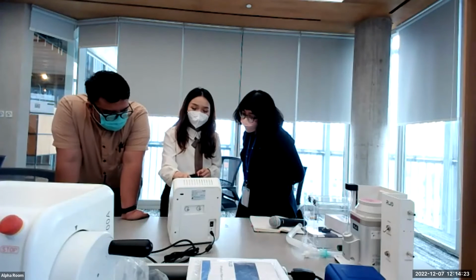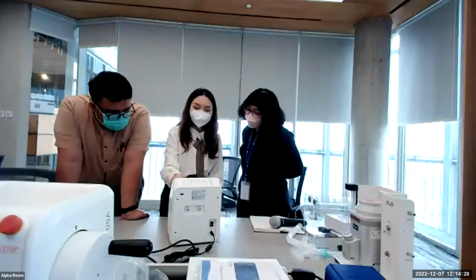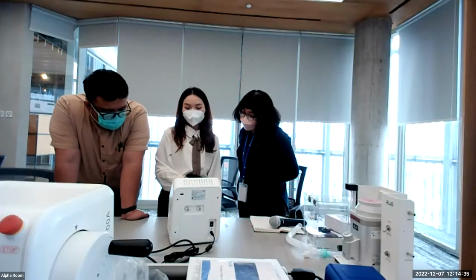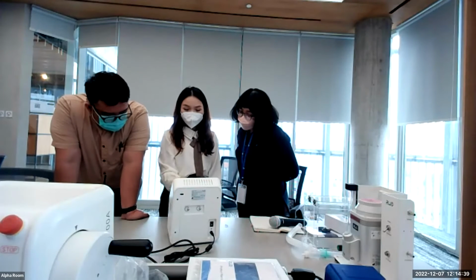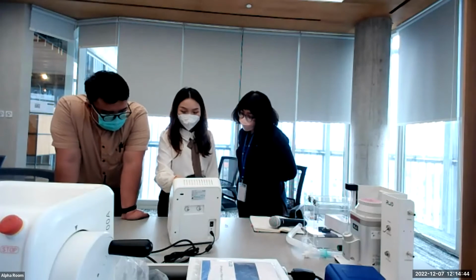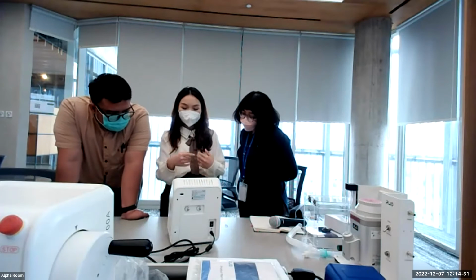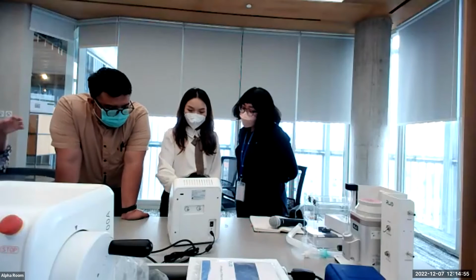Then the device will count the cell size per micrometer. You adjust it, then just count, and it will count based on your parameters.